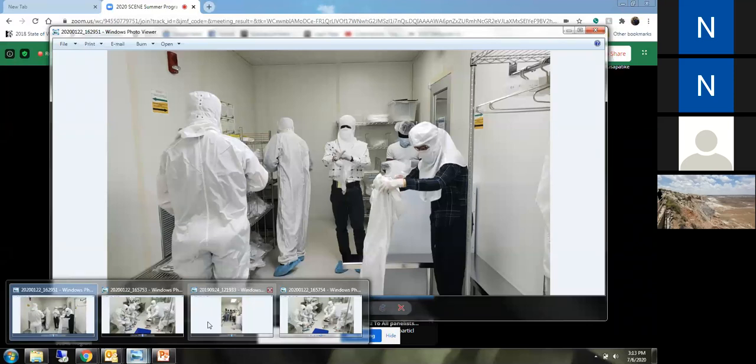And for those going into the clean room, that garment is polyester. It doesn't breathe. So make sure if you are going to the clean room, you have taken your weekly shower, you put on your deodorant but no perfumes, no makeup, no hairsprays, no lotions. Just put on a white t-shirt and a pair of jeans. A pair of jeans does not shed lint as much as a pair of wool pants. And always make sure you're not wearing high heels. You want flat-bottomed shoes.